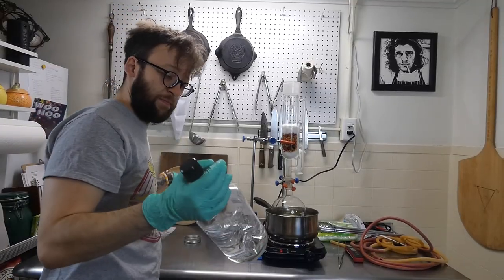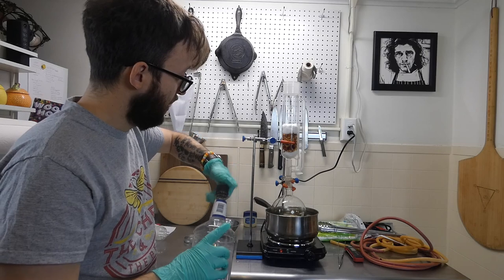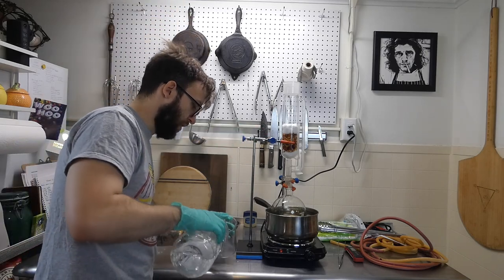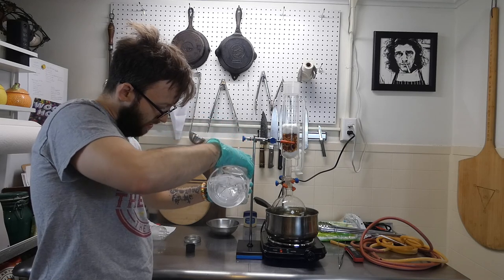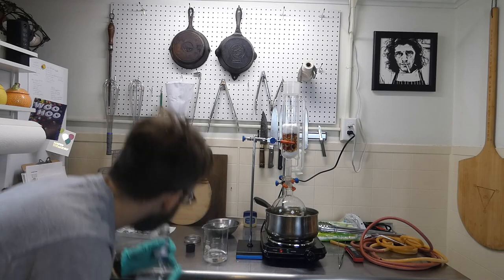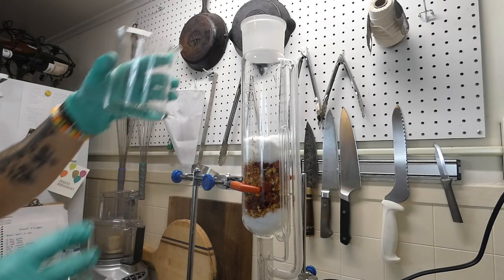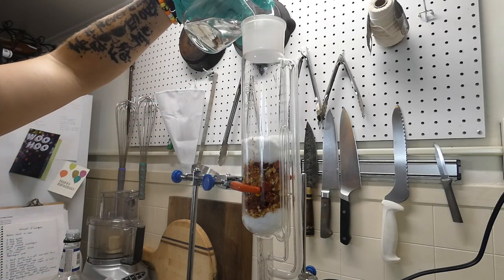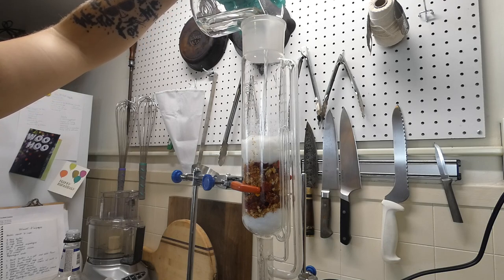So then you're gonna take some more alcohol, and you're just gonna do a quick wash to start the process going a little bit. So I'm just gonna measure out 100 milliliters at a time, just so I know how much ethanol I use total. And then you're just gonna pour this in the top, and you're just gonna start soaking the material.